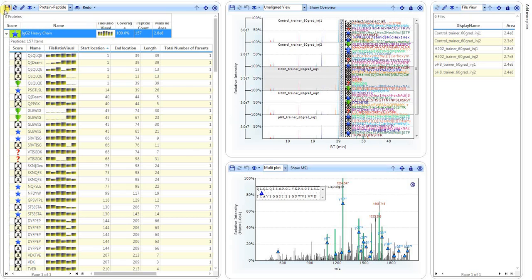And the first thing are the icons shown at the upper left-hand corner of each of these individual windows. As you can see, in the chromatographic view as well as the mass spectral view, a lot of these options are redundant. And they are, just briefly, if we just hover over them, the actual saving function or report generation. This is available in the tables to export to create an Excel document or a PDF file.